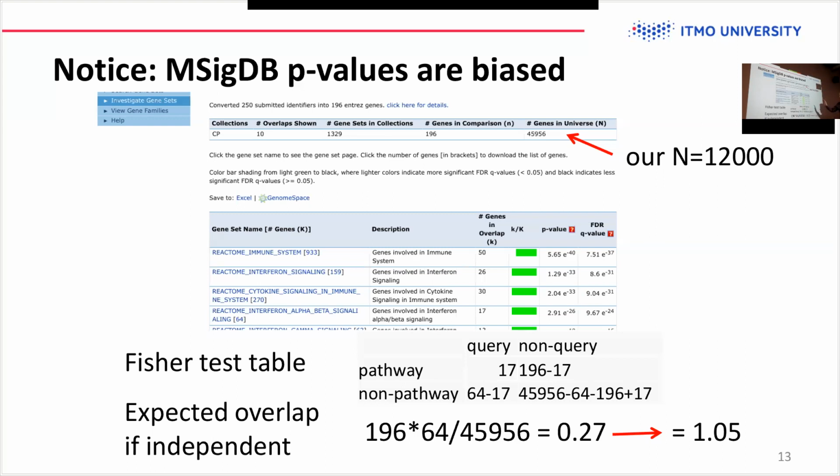However, in the MSigDB tool in particular, if you see an adjusted p-value of 0.01, which is less than the standard 0.05, it likely won't be significant if you do everything correctly. So be aware of this. Sometimes you have really random genes, with no significant overlap, and there will be some slightly significant results in MSigDB, but they are actually false positives.